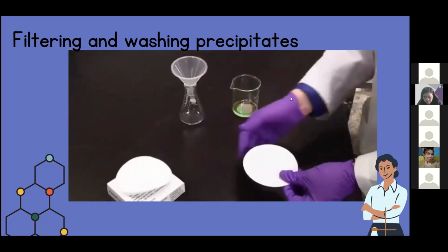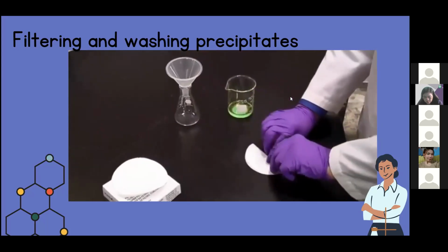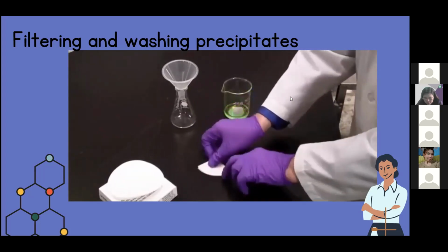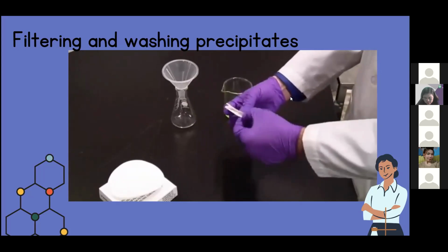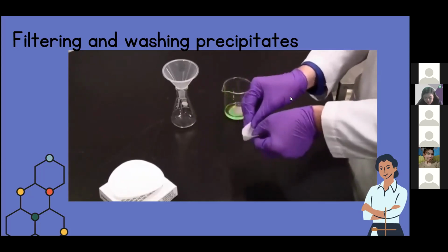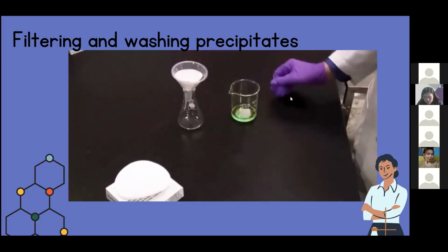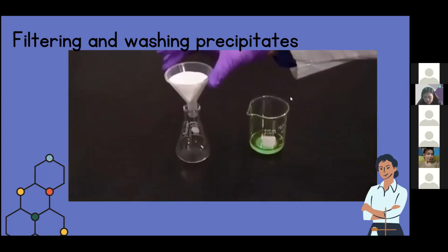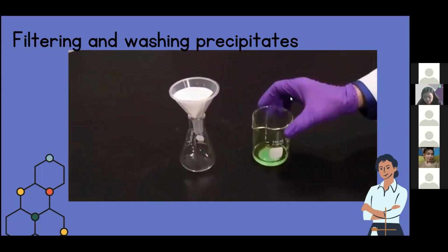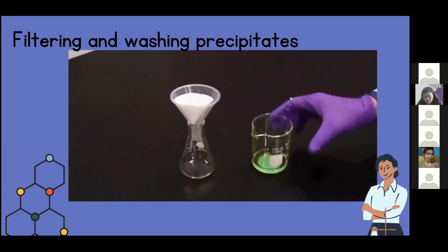Filter papers are circular, folded in half, and then in half again. Take this quarter circle and open it with 3 layers on one side and 1 on the other, and you have a small funnel that fits into the funnel. You'll need to have your funnel sitting above a receiving vessel, here a flask. You can use a beaker. Sometimes you may need to support this with a clamp, but usually it will just sit in the neck of the vessel.